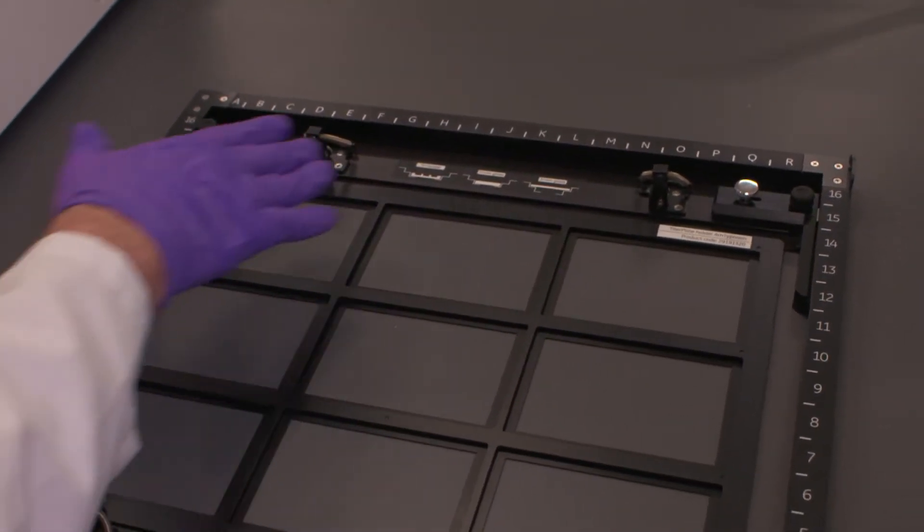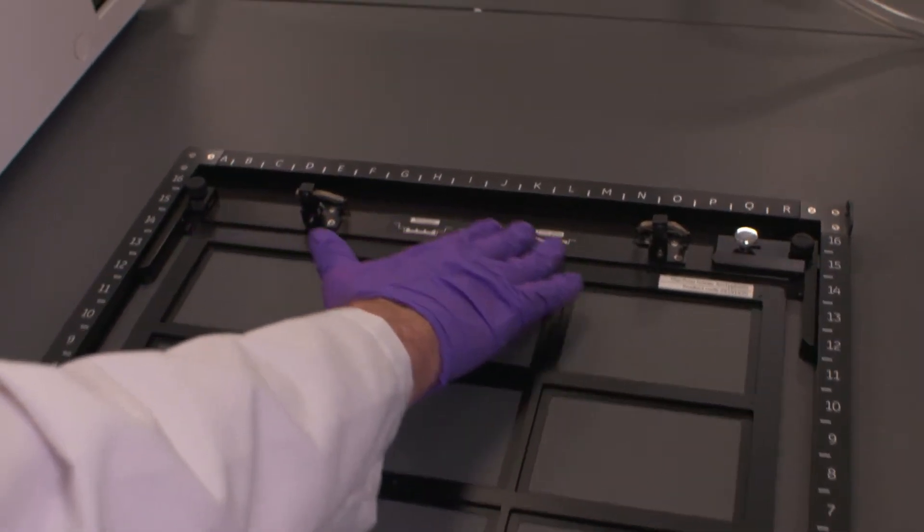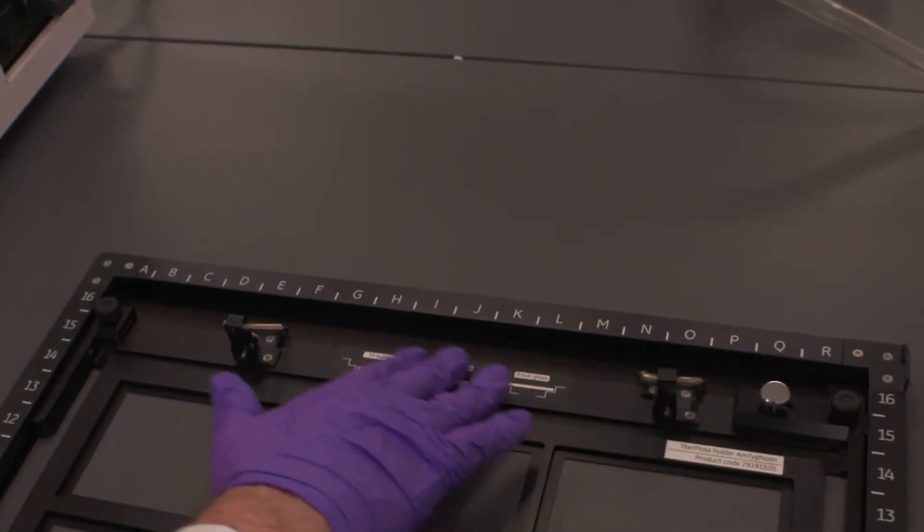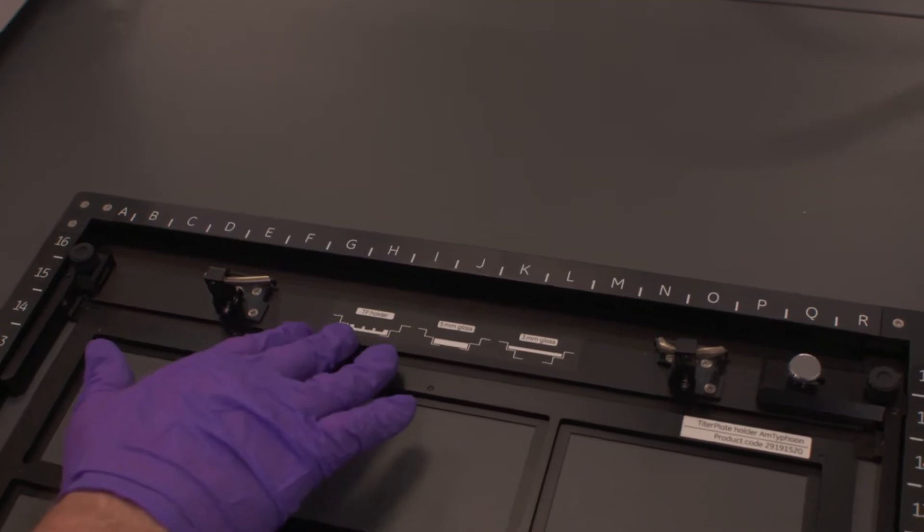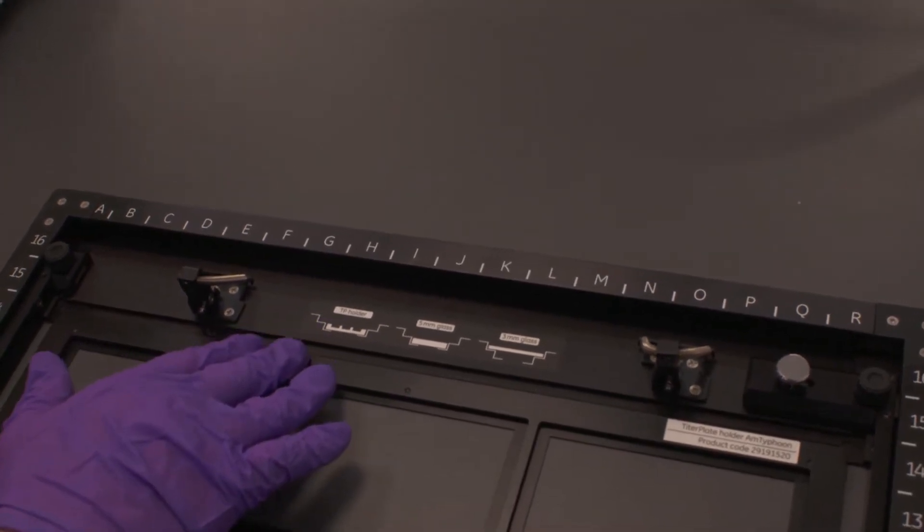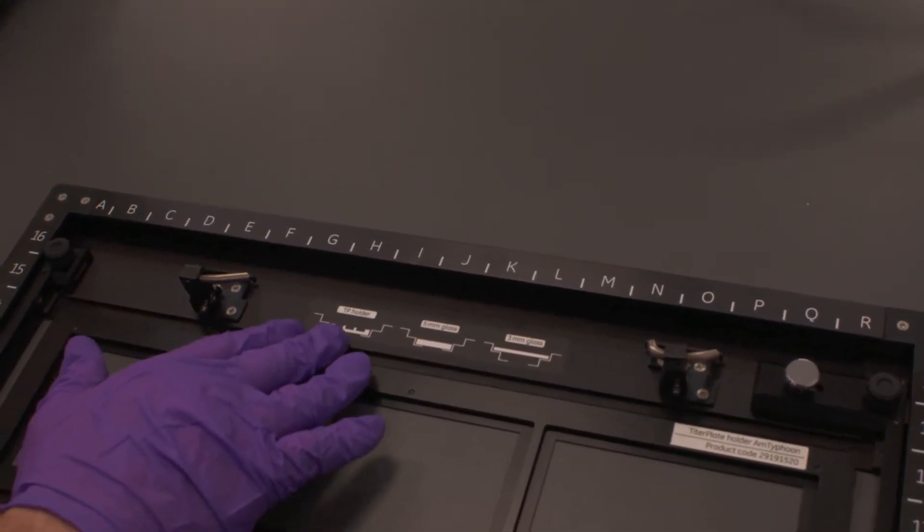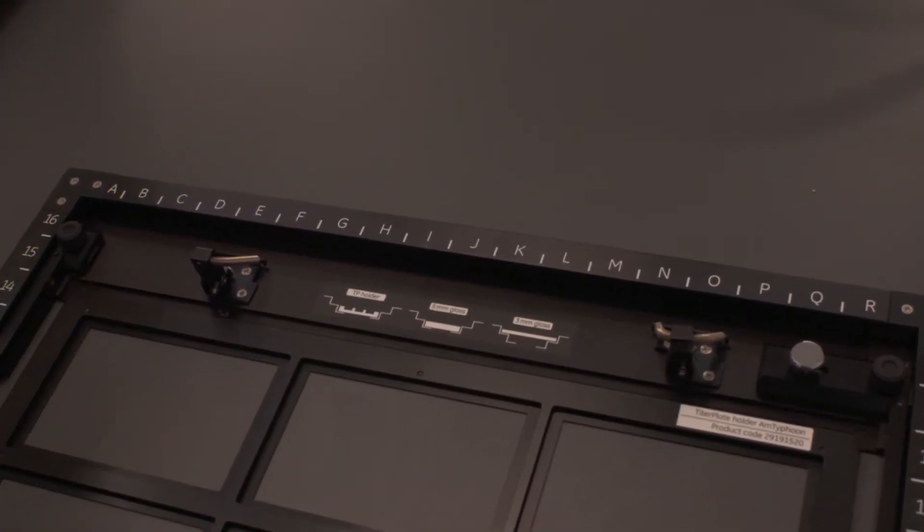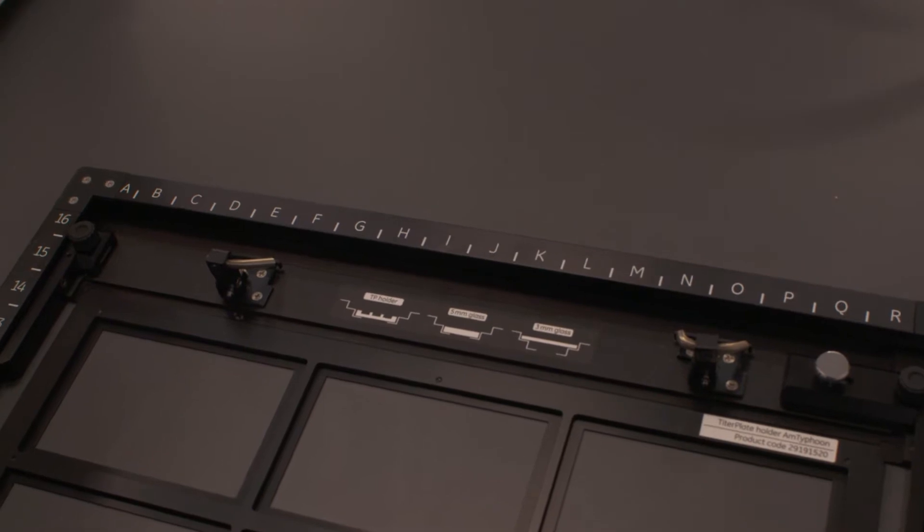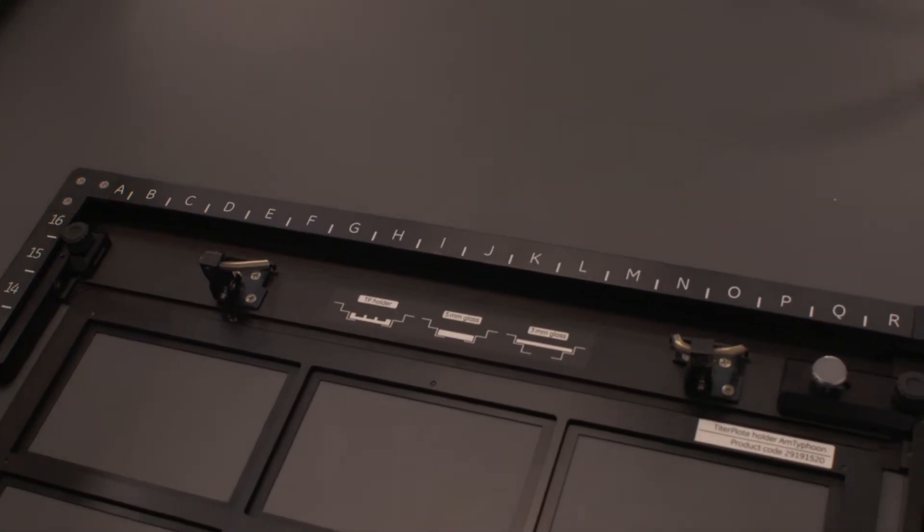When we do that, we enable the ability to complete this schematic here where the micro-titer plate holder sits in this lower lip on the multi-stage.